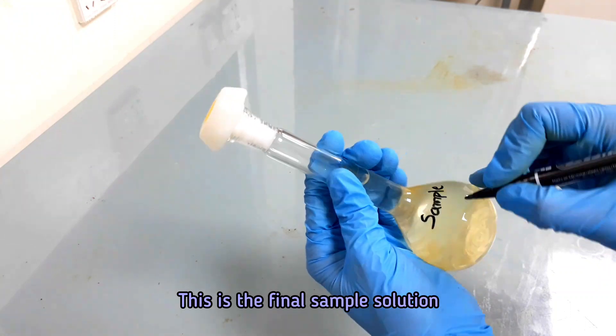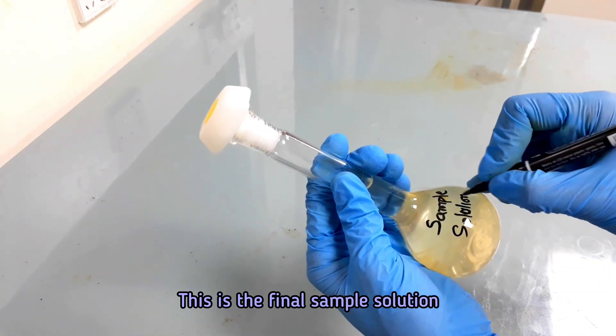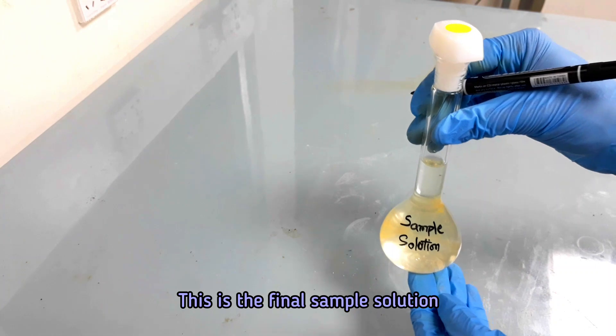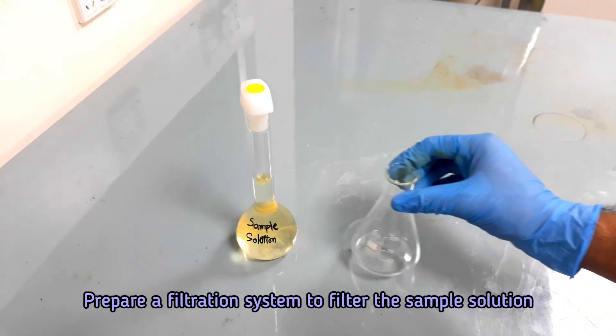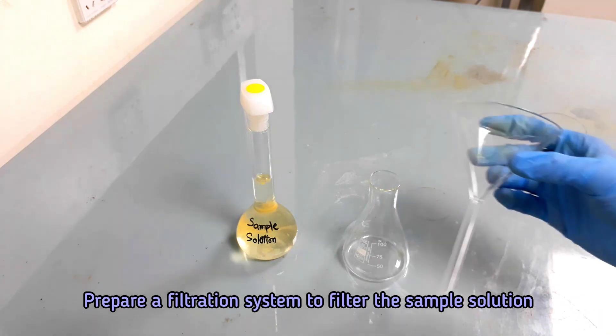This is the final sample solution. In this step, we will filter the sample solution. Prepare a filtration system using the Whatman filter paper.